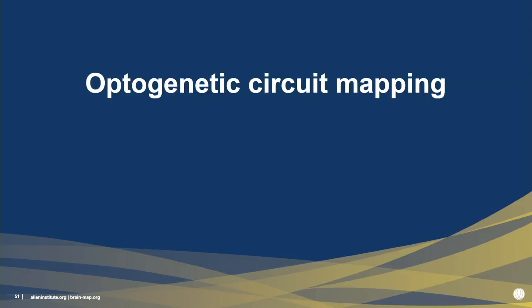So coming up very soon, Alice is going to tell us about the optogenetic experiments that I just described, followed by Alex, who's going to talk about multipatch. And at the beginning, I mentioned that what we really want to be able to do is to take all of these experiments and build up a picture of the way the system works as a whole. And so Jung is going to take us in that direction and talk about what happens with our data after it leaves the pipeline.